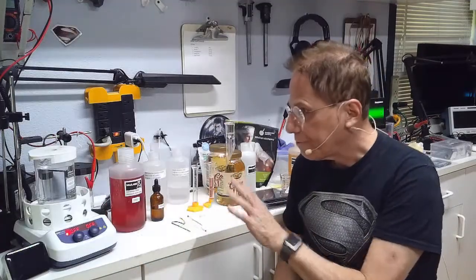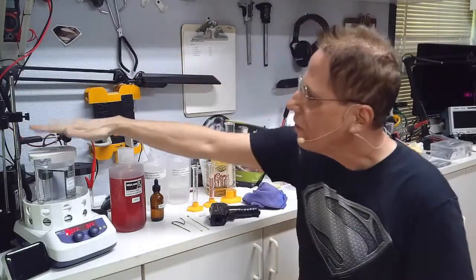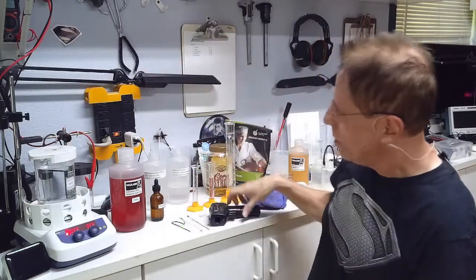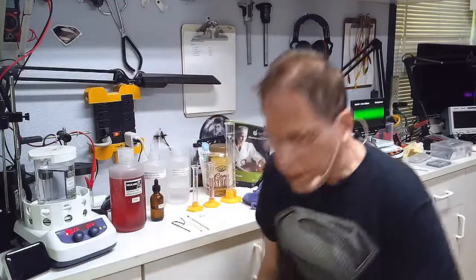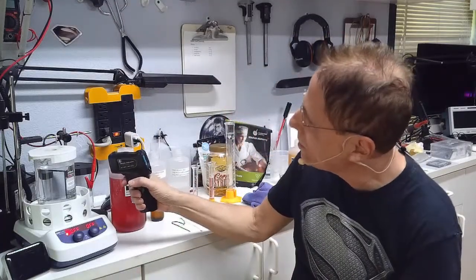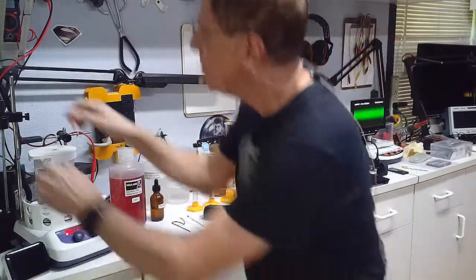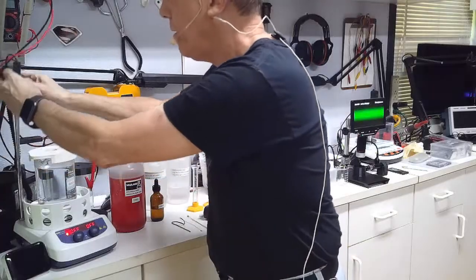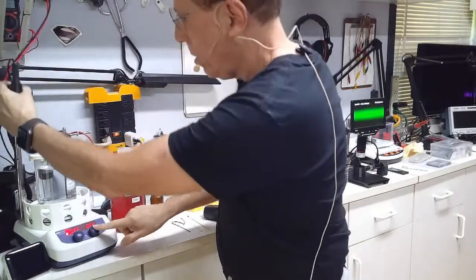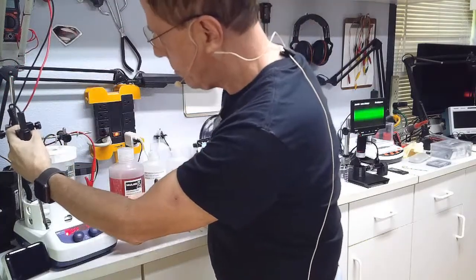To save time I've preheated this water in the microwave to get most of the way to where it needs to be. We have to heat the water to 90 degrees C — right now it's at 81 degrees. First we're going to put the stirrer in there to keep it stirring, then we'll put in the temperature probe.